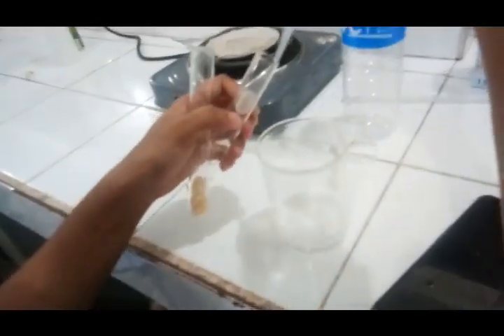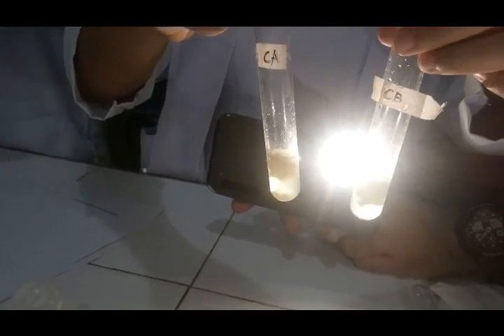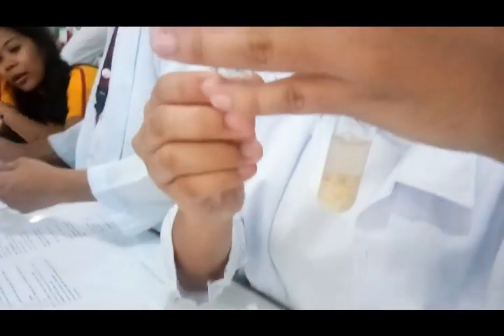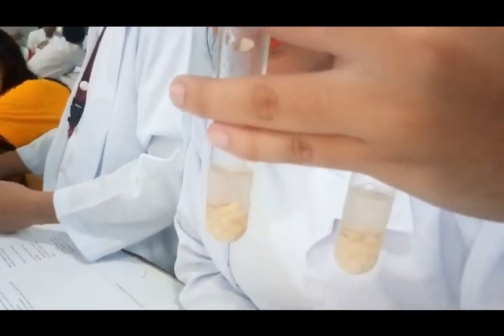Potato chips possess a slight turbidity on both test tubes, weaker than the albumin and the two milk variants. Being synthetic and not pure on potato content, chips such as this will read low protein concentration. However, this is kind of ironic given the results of raw potato. It presents almost no precipitate on both tests, except for some color change on test tube A.